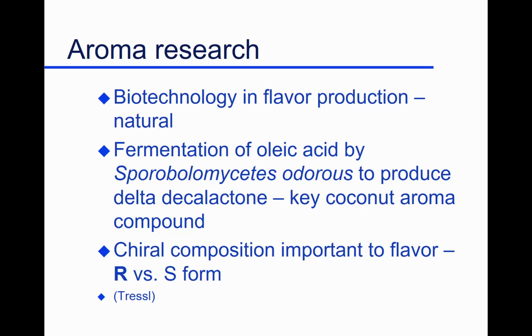So you're going through the fatty acid one. I think that shows up later. But here's just giving some examples of where we would use gas chromatography.